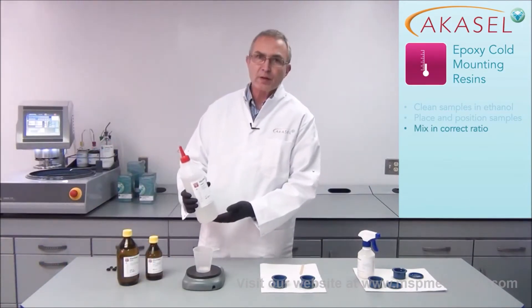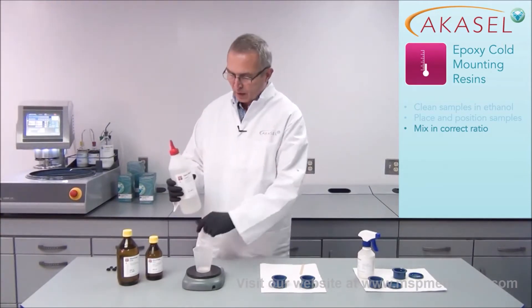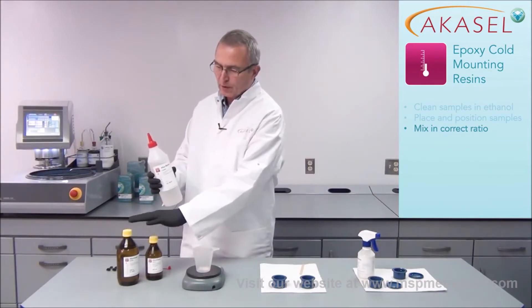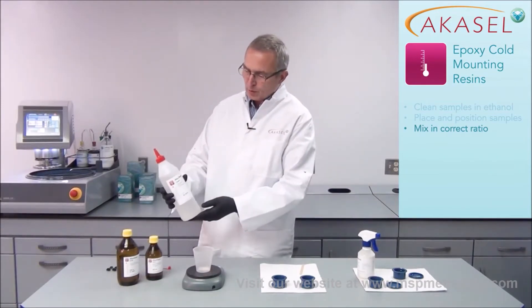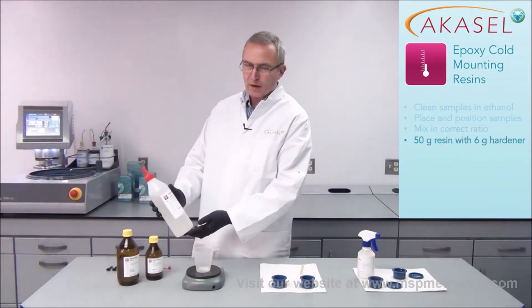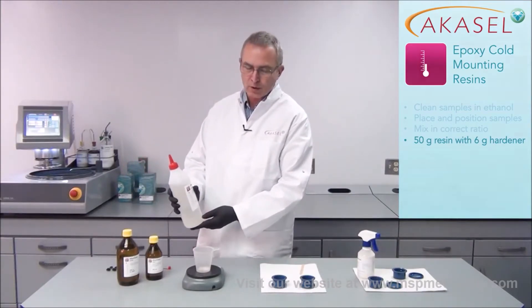With the epoxy resin, it's very important to mix it in the correct ratio. The label states how much of either hardener should be used together with the resin. In this case we're using 50 grams of the AKA resin liquid and 6 grams of the AkaCure Slow.